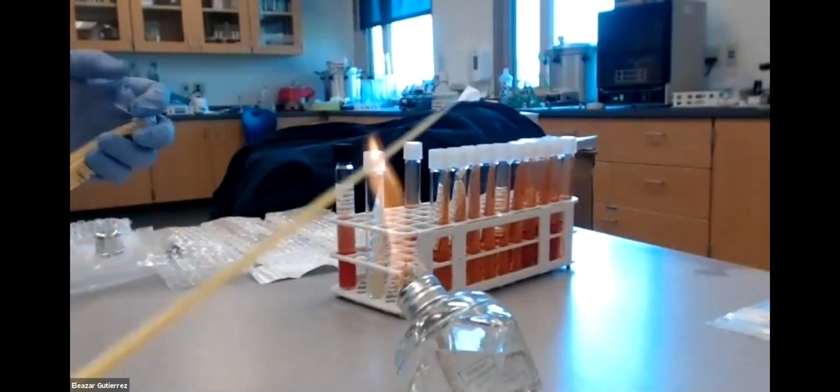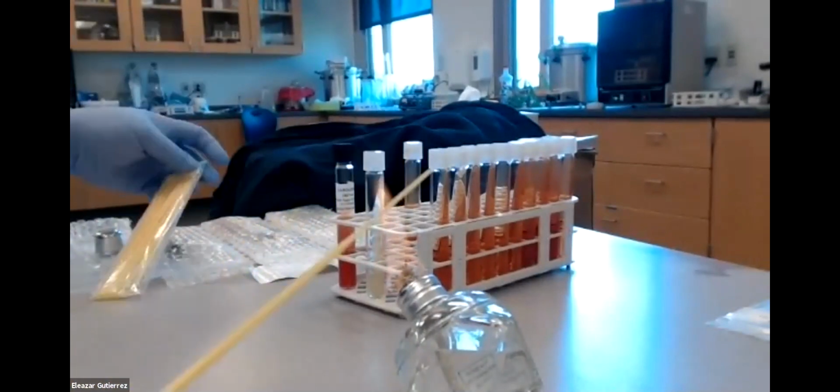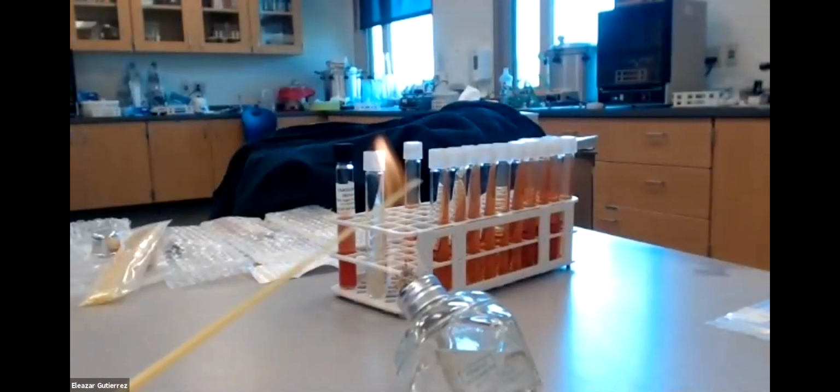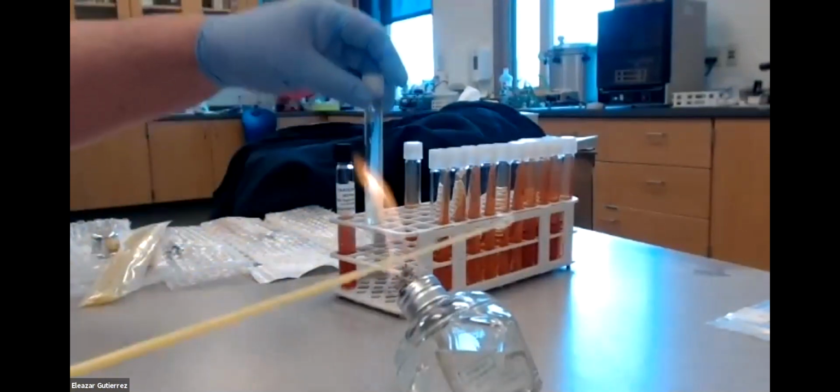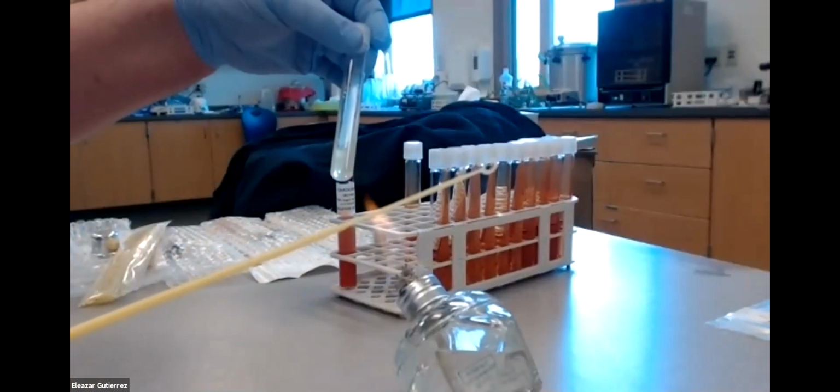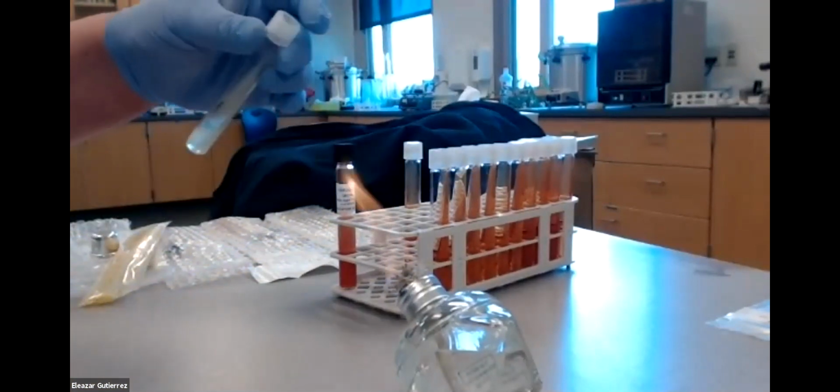Okay. I'm not flaming this. It happens to be in front of my fire, but I'm not flaming it. Okay. Don't do that, or you'll melt it. The reason I have this guy here is because there's my E. coli, and that needs to be flamed.